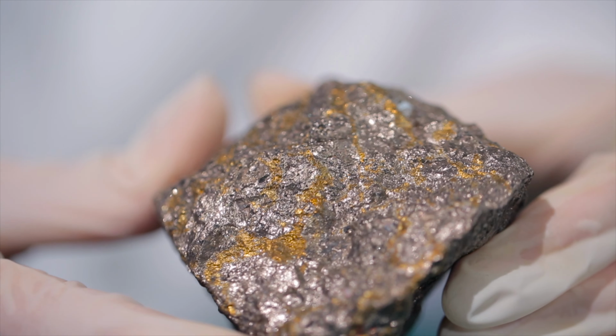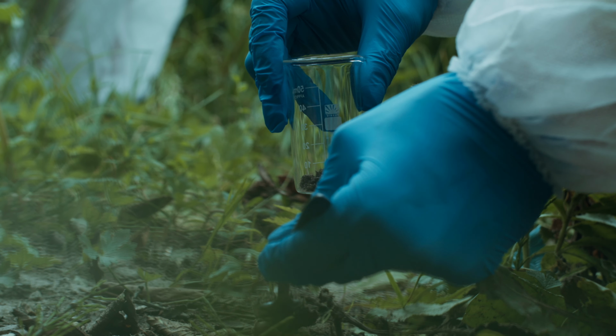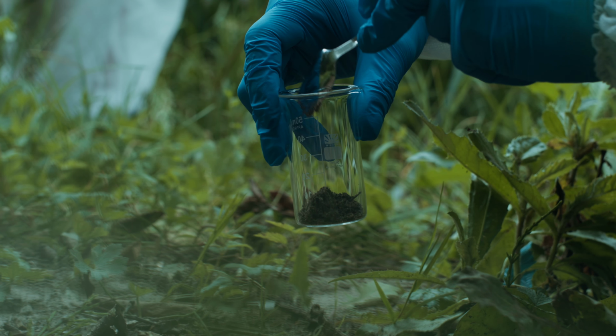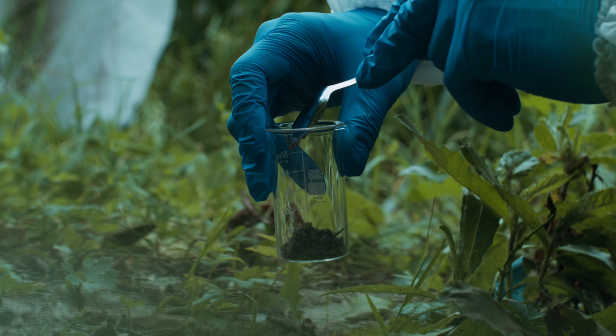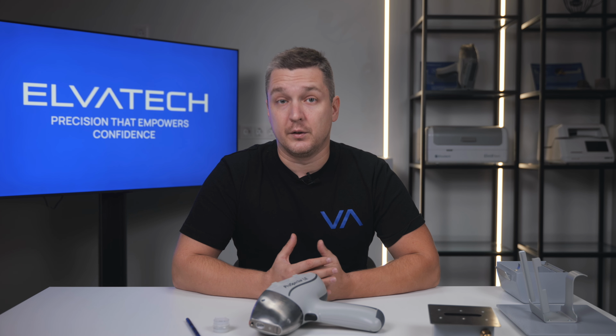Ores, ceramics, soils, powders, all of these materials are heterogeneous, and analyzing a single point only gives you a fragment of information. Averaging provides the overall picture, a representative result for the entire sample.